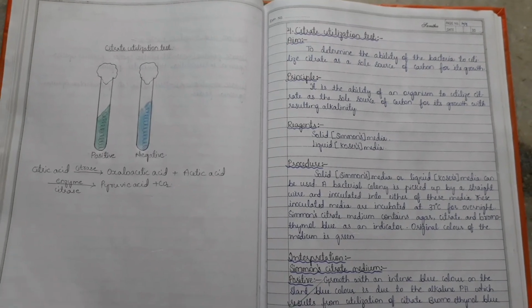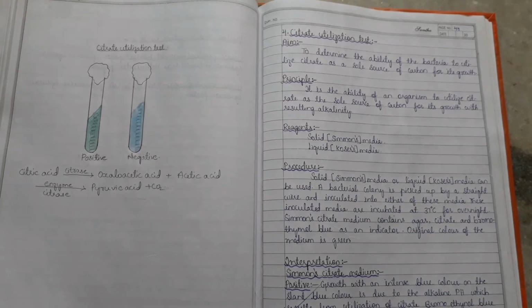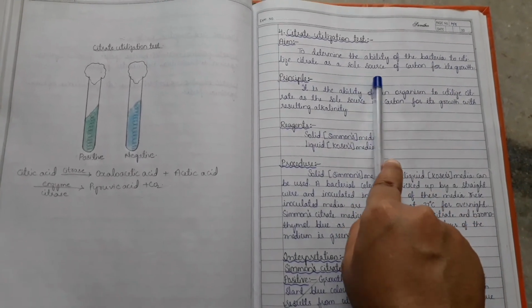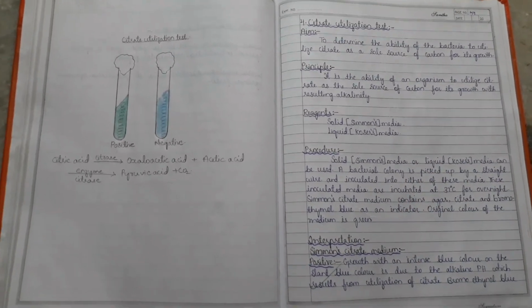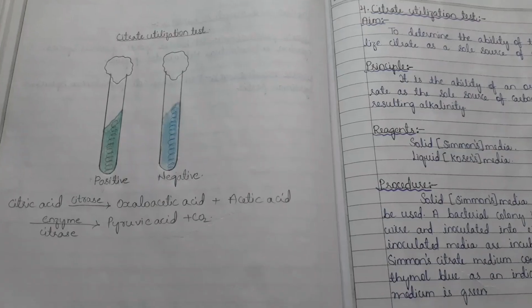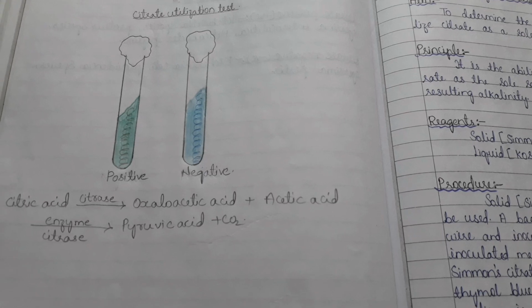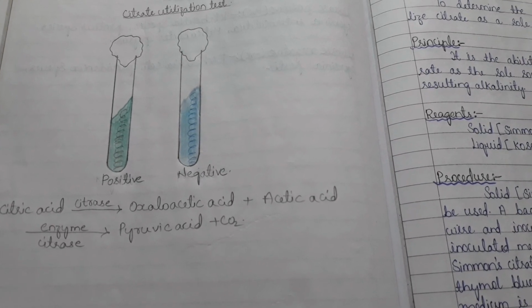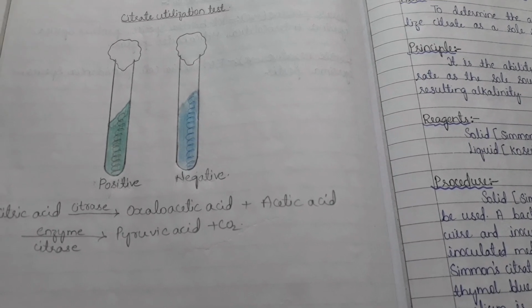So coming to the citrate utilization test, to determine the ability of the bacteria to utilize citrate as a sole source of carbon for its growth. So this is a picture I've drawn here. Citric acid gets converted into oxaloacetic acid plus acetic acid.